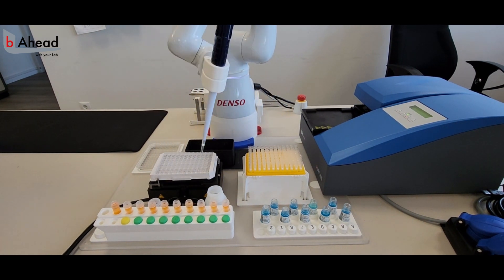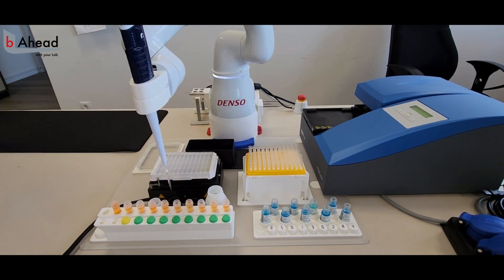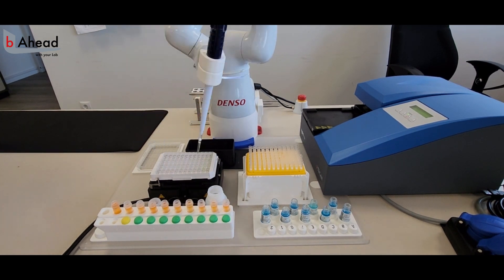And if you are wondering what happens now, we are currently working on implementing a reader to get the results of our test and send them to the electronic lab notebook.